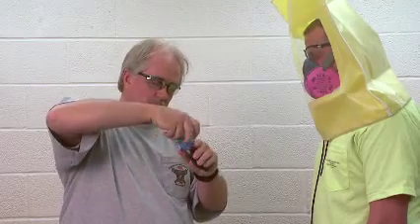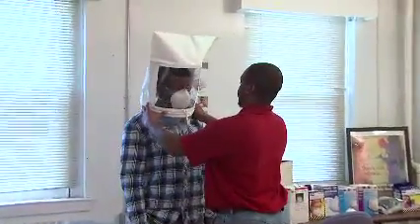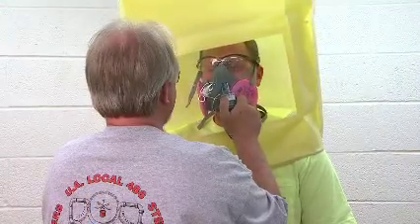Qualitative fit testing is normally used for half-mask respirators, those that just cover your mouth and nose. Half-mask respirators can be filtering facepiece respirators, often called N95s, as well as elastomeric respirators.